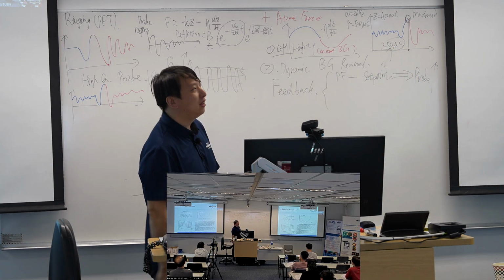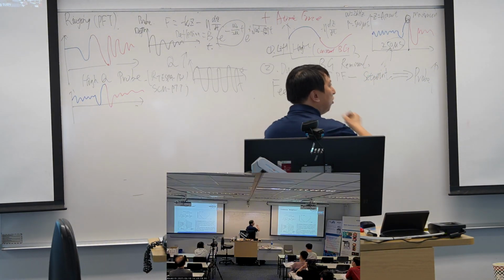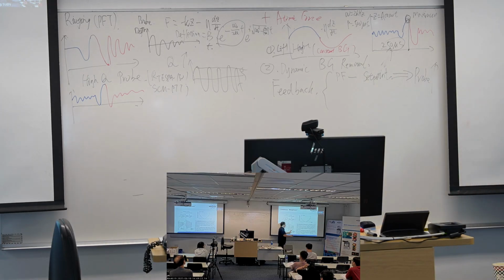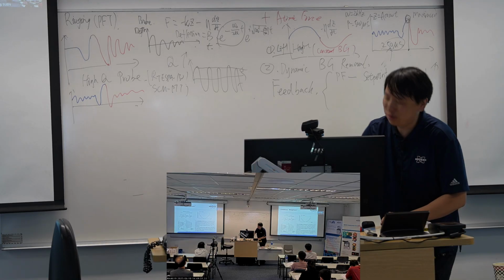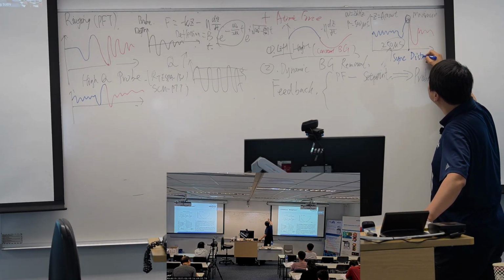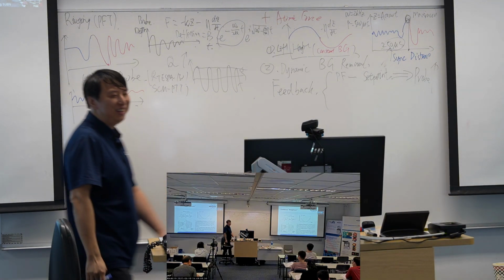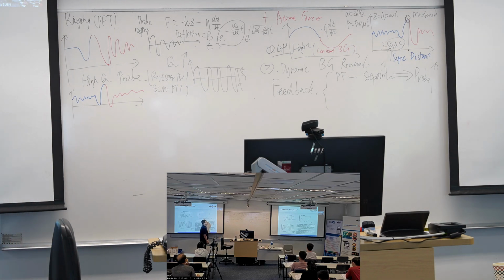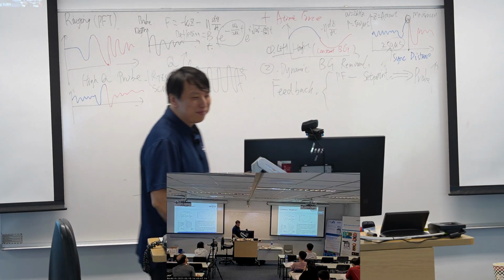So that's the idea used by Bruker. And this idea, they call it synchronous. And this time point, Bruker gave a confusing name called sync distance. It is a time, but Bruker called it distance, maybe for them it's a smart way to let nobody know what's going on.